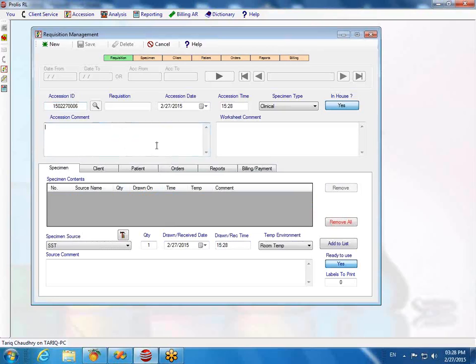All right. Any question about accessioning? Oh, I think this looks good. I think you've done good homework on it. All right. Very good. Okay.